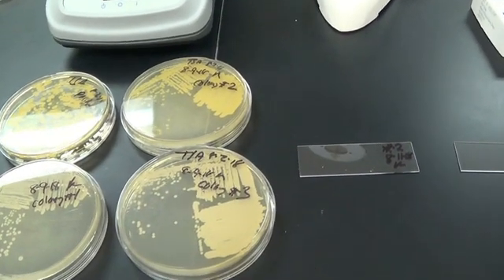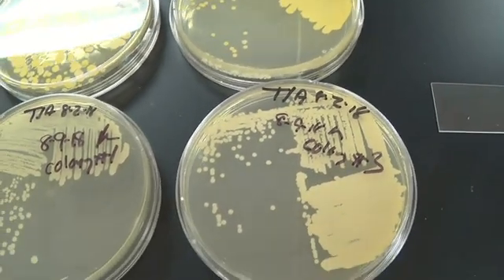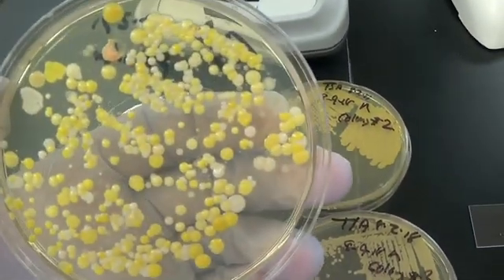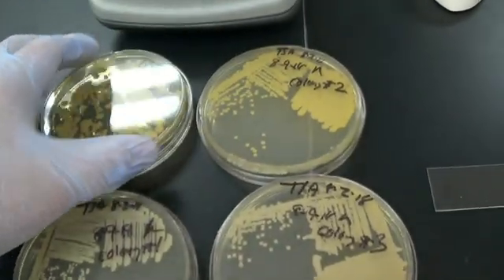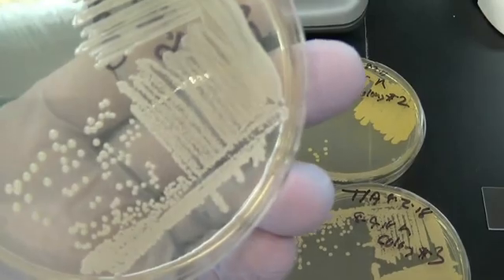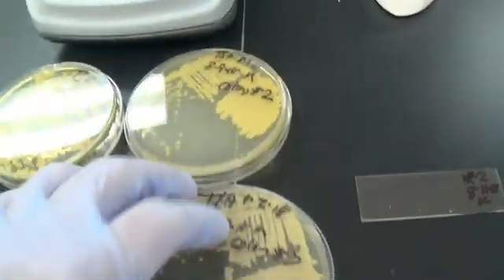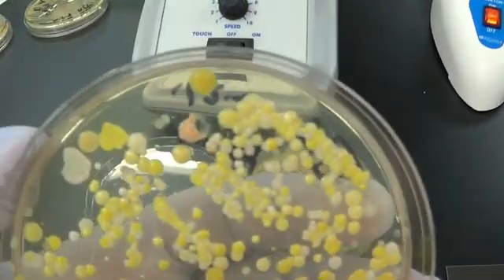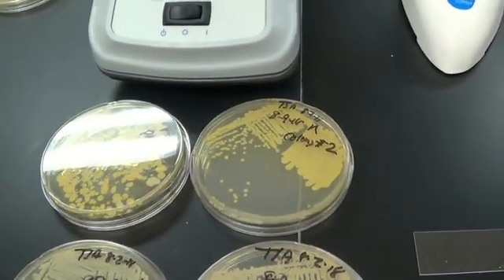This video is on gram staining. I took out of the incubator the three plates that I was working on last time. This is the original plate of bacteria growing on my fingers. I found three different colonies and they all look a little bit different on the plates — this one is very yellow, these two are both kind of white but different shapes. I also have a fourth orangish one that I am going to gram stain.